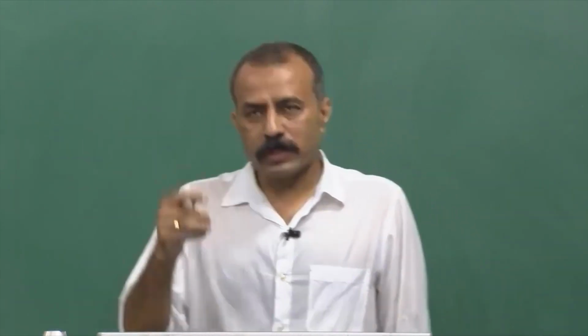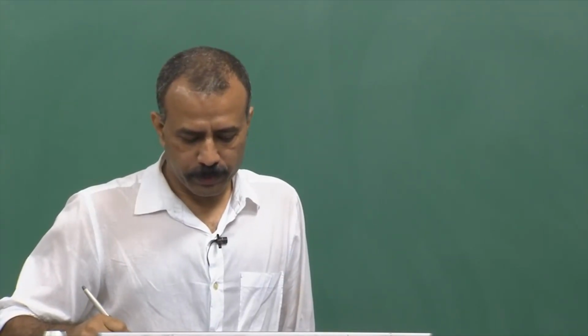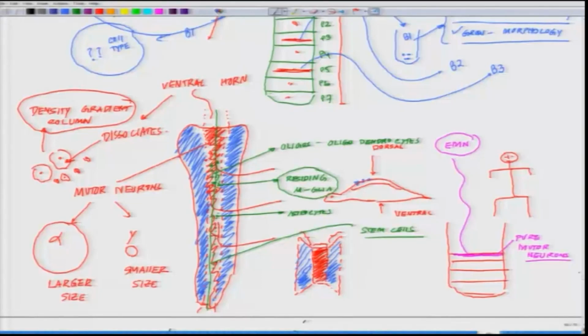So, now think of where we started. First, it requires a proper dissection ability, step 1. Then it needs enzymatic dissociation, and then it requires density gradient centrifugation.